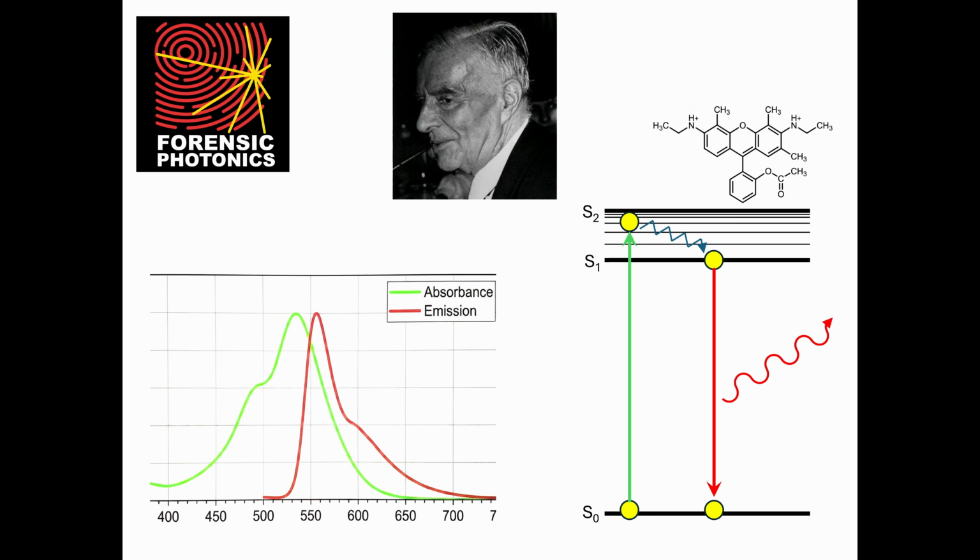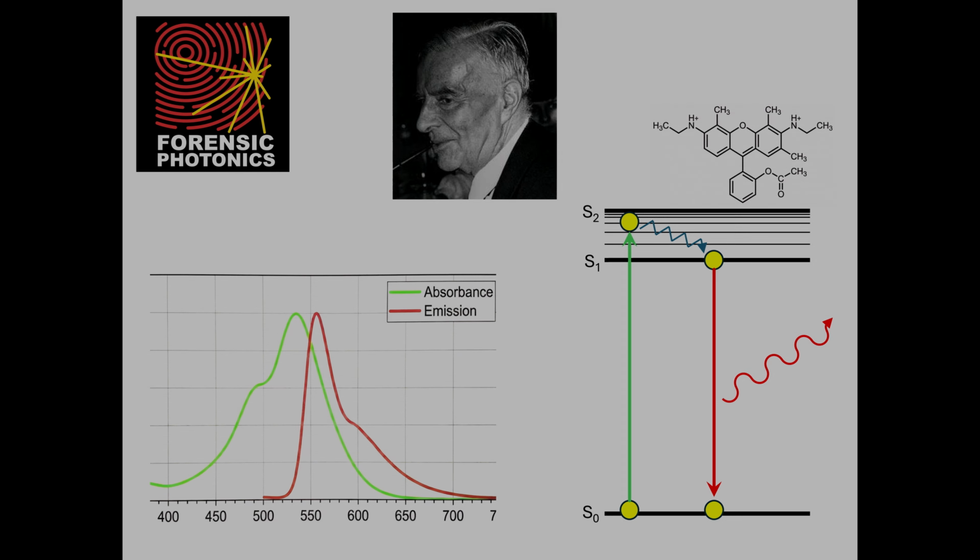The Jablonski diagram visualizes this whole process, energy in, energy out, almost like a schematic of a pump. It shows the photons we put into the system and the new photons we get out. We'll refer back to these principles throughout the year as we explore fluorescence imaging in detail.